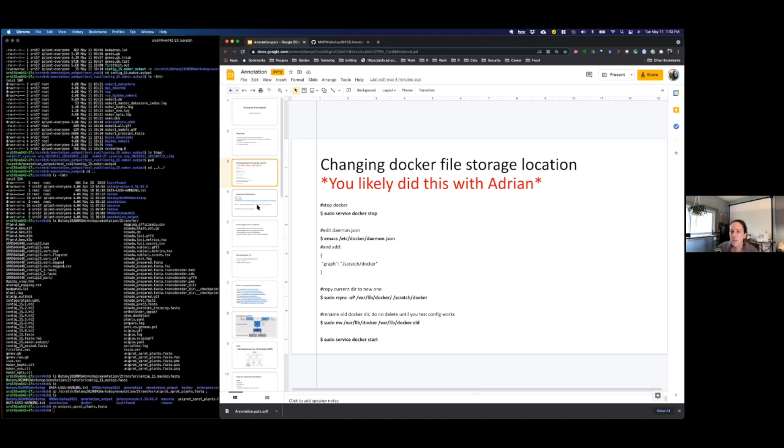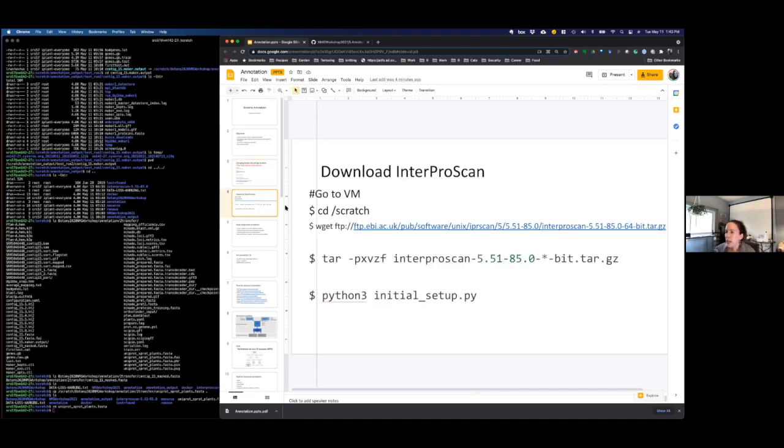So the idea of Docker is to have everything in this nice little package, and then you just use Docker to deploy those tools. So in theory, it's usually preferable. If you're publishing any software, I think it's really recommended that you supply it as a Docker container, because it's easier for reviewers to deal with the software instead of installing 5 million different things. So that's why we use Docker, in case you've never heard of it before. There's also something called Docker Hub, kind of like GitHub, only it's for Docker images. You can go there and oftentimes find that someone's already made an image of a tool you might be interested in.